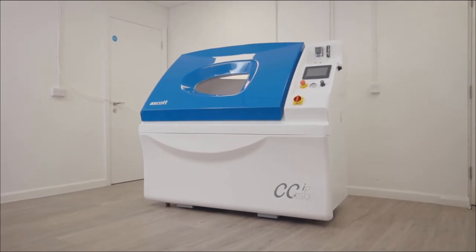Hello, I'm Martin Reilly, Customer Service Manager at Ascot Analytical. Today I'm going to give an overview of our cyclic corrosion chambers.